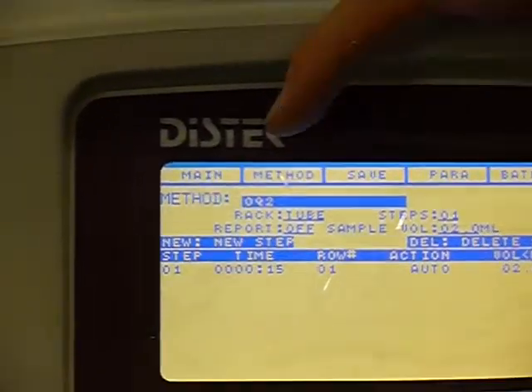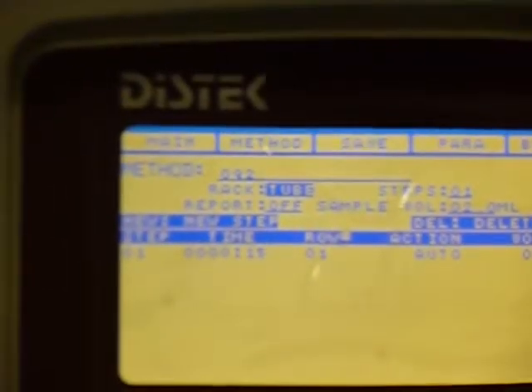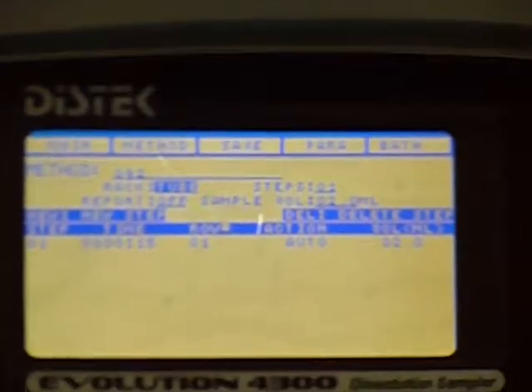Okay. Now, there's where it says rack tube. So this is which method? Oh, this is OQ2. Oh, we're in the OQ. It's written all the procedure in here. OQ2. Now, if you want to follow that, but I was just trying to explain up here.